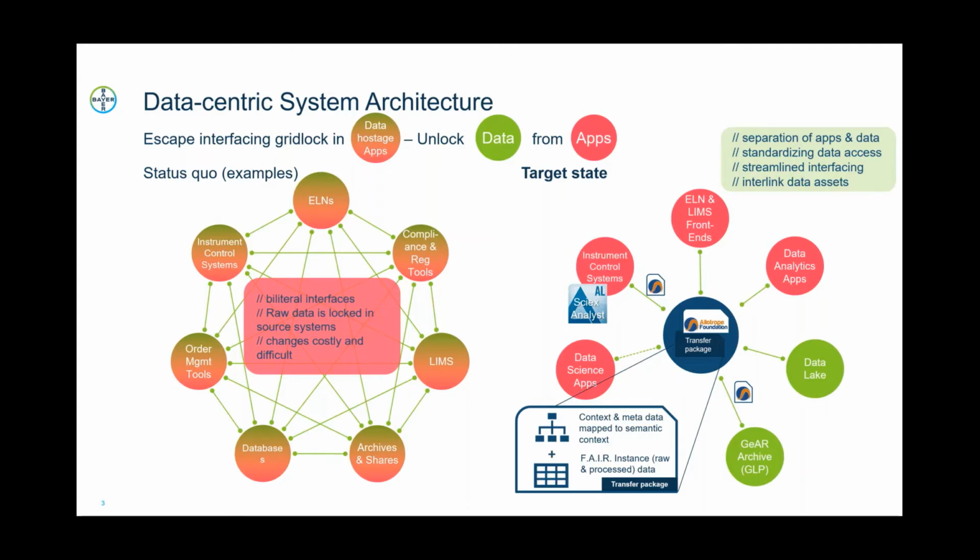We think our lab data should be encapsulated in a similar way, so that if anybody finds it, he should himself be able to get the context on it, process it, and have a look at it, independent from the system of record that was used to create it.